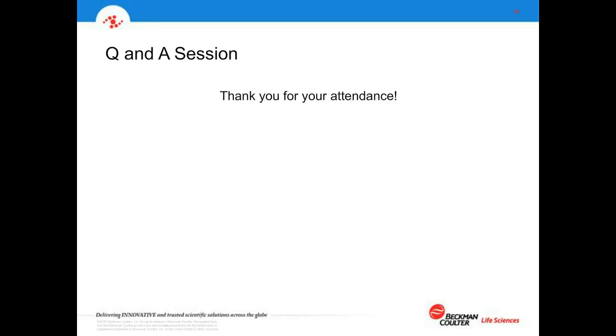It means it was a consideration, you might say, put in by the committee that changing all the particle counters used by a particular customer or particular user or particular facility might be an onerous financial cost to do instantly. So again, not all counters were designed or are maintained to that. What it does mean, though, is you have to record that on the document for your classification. It'll show up as, I didn't use an ISO 21501-4 instrument.